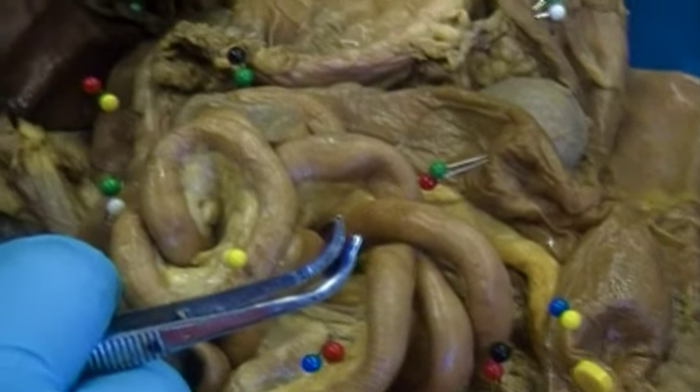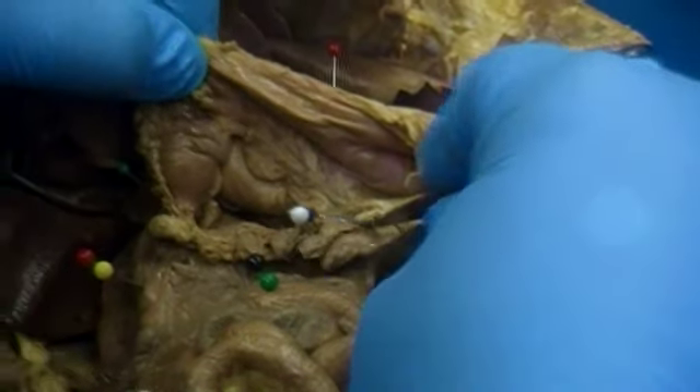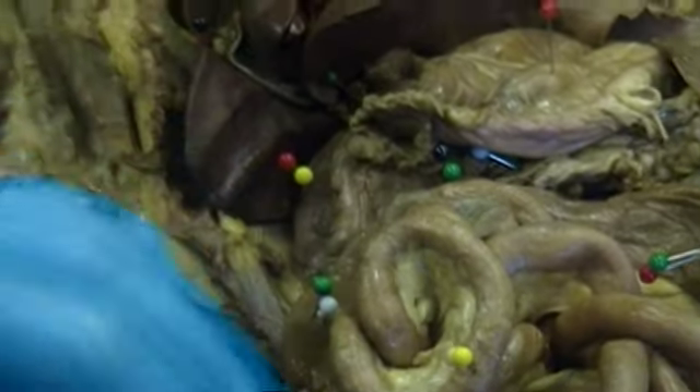There are additional structures you need to identify: the green and white pin structure here is the spleen, the blue and white structure here is the pancreas. You should also be able to identify the greater omentum, which is not currently visible but is still required.